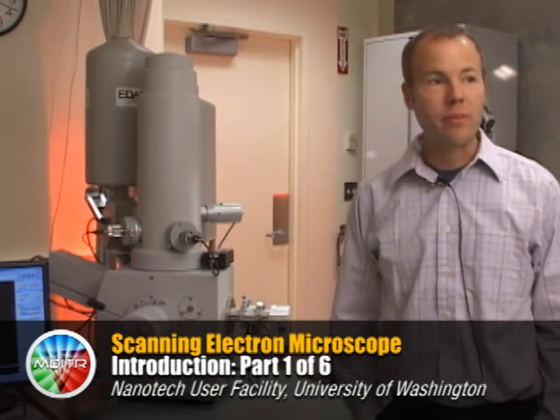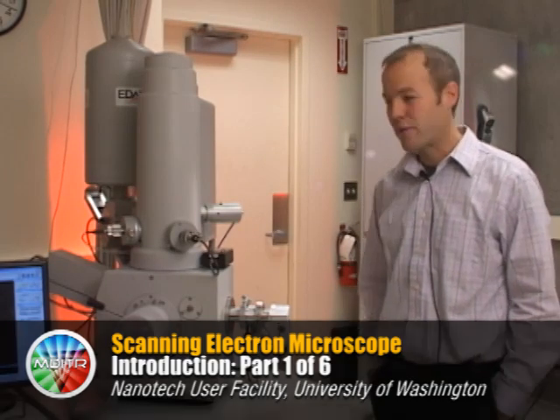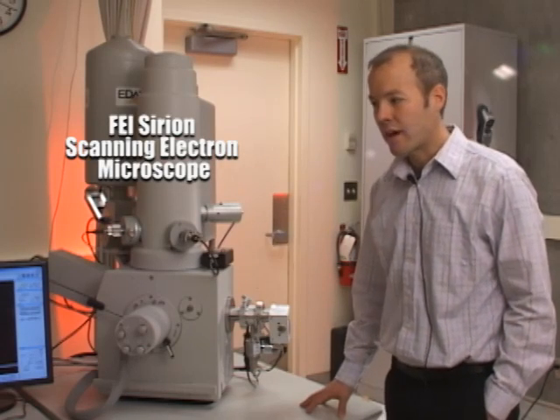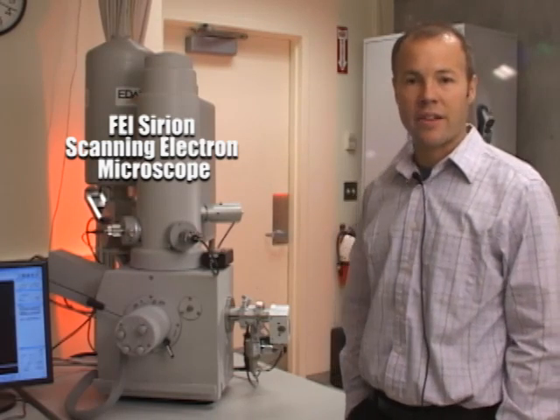Welcome to the E-Beam suite at the Nanotech User Facility at the University of Washington. My name is Scott Braswell and I'm responsible for this instrument. This is a scanning electron microscope — an FEI Sirion, a field emission scanning electron microscope.